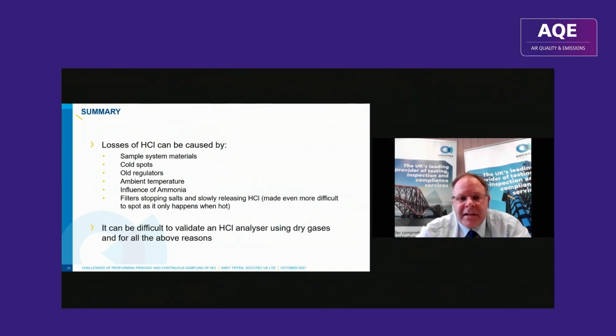One of the validation tests that we did many years ago was actually to do some dust testing on a site where we were struggling to get agreement between the two, to look at the effects of these ammonium chloride salts. And we did 18 separate particulate runs, relatively high results on those, higher than the continuous monitor we're seeing in the stack for particulate. So the filters were sent away for analysis for chlorides.